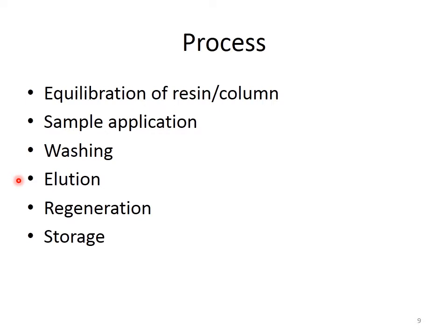The process of removing the proteins from the column and releasing them into the buffer is called elution. So different proteins will be eluted under different conditions. In this manner, we periodically alter the conditions, and proteins with different properties are going to be eluted at different conditions. The proteins which are eluted in a particular condition are collected in a separate tube. So in this manner, the proteins are going to be fractionated. They are going to be separated from one another.